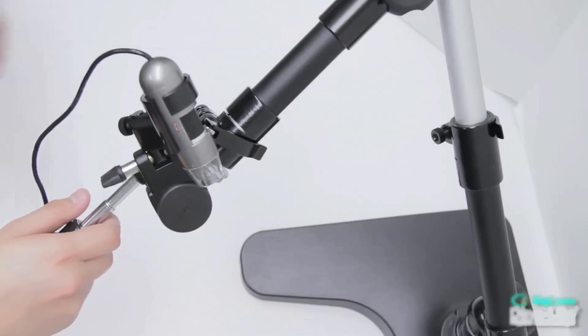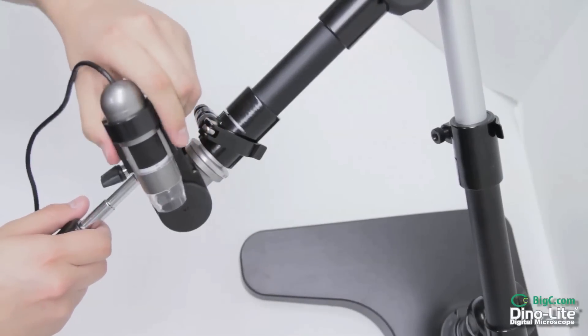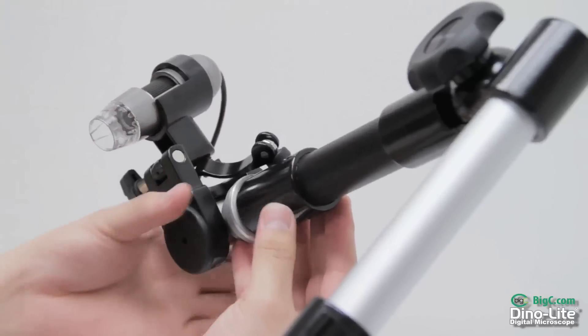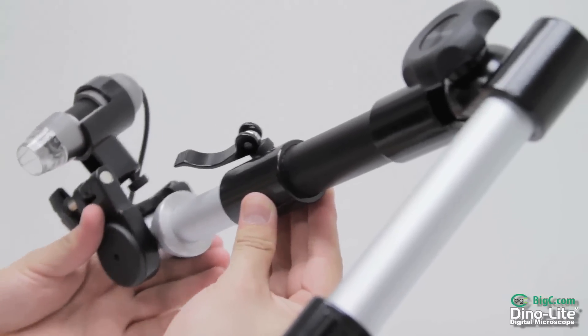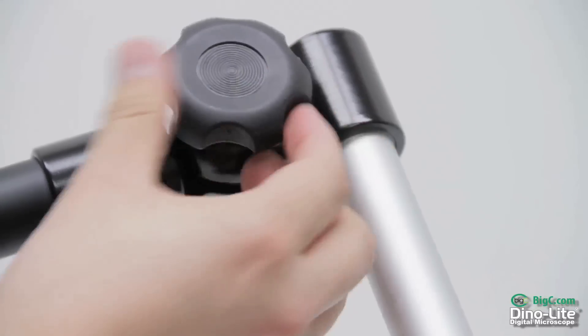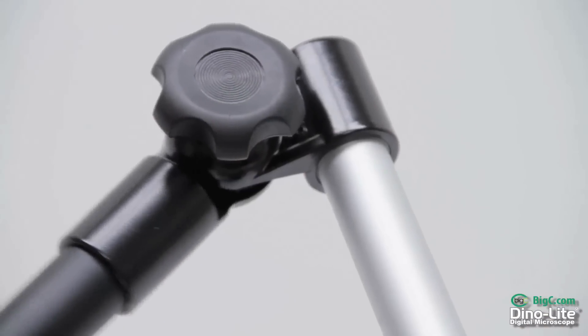The MS-52B is our large all-metal articulating arm stand. This features a lockable telescoping section going from 23 inches to 36 inches, as well as lockable elbow joints pivoting 180 degrees.